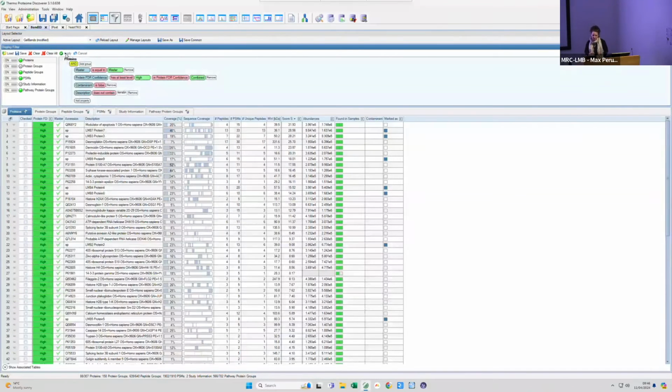So it updates. One other thing is that this is again a back and forth conversation between us and the user. For instance, if you are more interested in identifying proteins from a specific complex, you say, I just want to see if these proteins are in there. You can give me whatever else is in there, but I really want to see if my proteins are in there. You can just provide us with a sequence, and we'll create this as a marking database. And you can actually see here on this right column that the proteins that are marked in blue are the proteins that we were asked to look into.